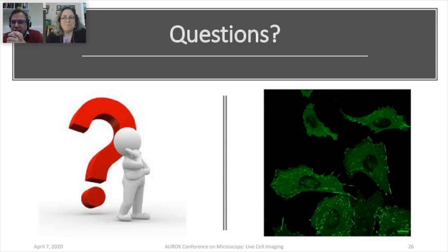We have quite a discussion, actually not so much questions, but discussion going in the chat panel here, mostly around TTL versus USB and all the intricacies therein. But I would like to ask you a more sort of optical question first, if I may. So you clearly advocate the approach, stretch the exposure time as much as you can and reduce the light level as much as you can.